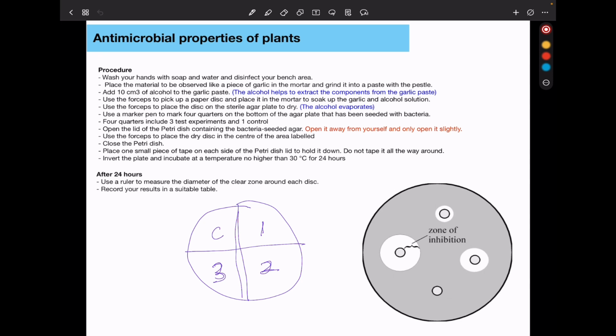While placing the soaked filter papers, we have to make sure it's done opening away from ourselves because, of course, we can have some microorganisms coming from our breaths going into the sample and contaminating it. Then we can close the petri dish, invert it, and then place it into an incubator to maintain the specific temperature.